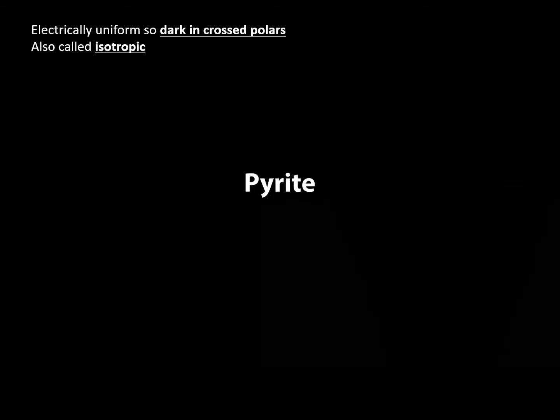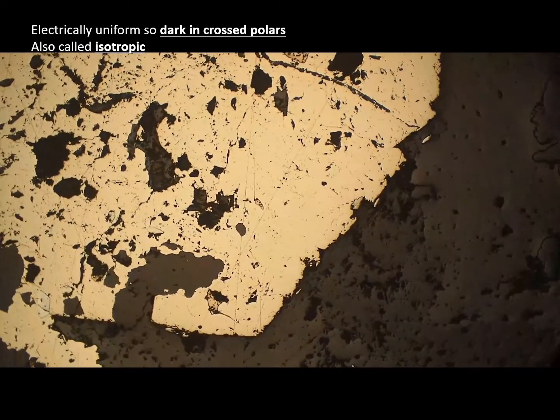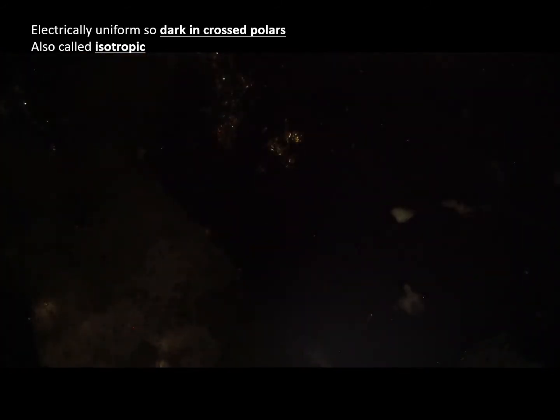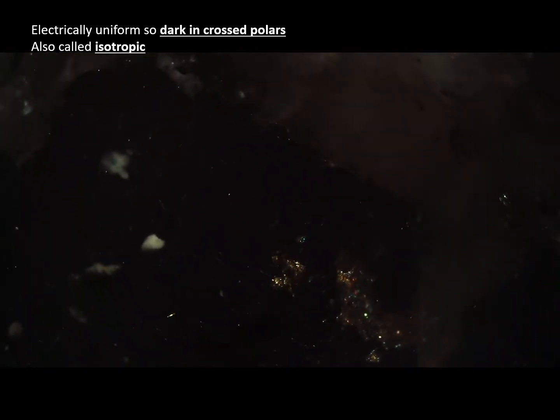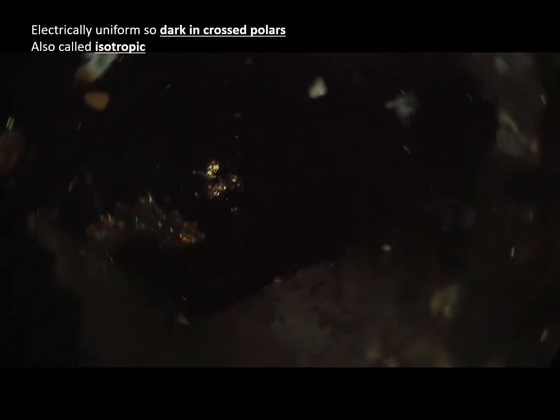So we're going to have a look at pyrite in cross polars. Here's our pyrite before. This is just in reflected light. Let me rotate it for a second, and then we'll see it in cross polars. Here it is in cross polars, and you can see this is our pyrite crystal here, and we're rotating it again. It's completely dark, therefore it is isotropic, and that is a diagnostic property of the pyrite.